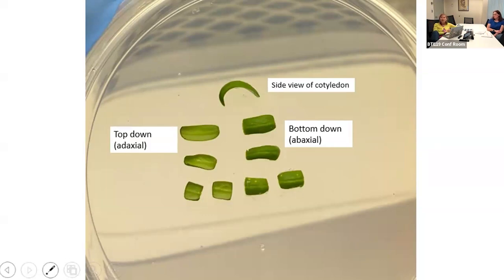So we did experiments where we looked at with and without the feeder layer. And we saw no significant difference between using a feeder layer and not. So that's not something that we introduced. That was based on a much older protocol that was being used when I first came to BTI. But it was just questioning, do we really need it? And we didn't. So we stopped using the feeder layer. Okay. Yeah. Thank you. Sure.